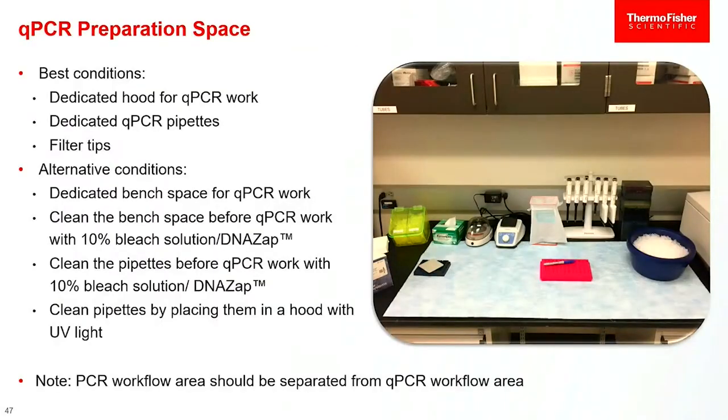So if you've never worked with these amplification reactions before, you're going to need to know that DNA is going to float around. It is like magical. It will float, sometimes just opening a tube and then swinging it over your negative controls is enough to get amplification in your negative controls. Okay, seriously, it's like magic.